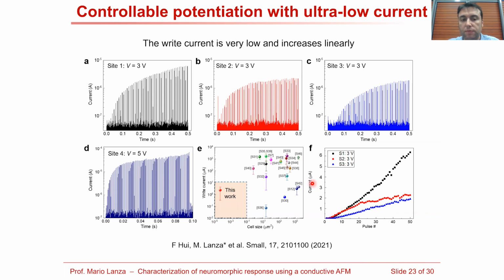We have observed that when we compare with many other studies in the literature, this value is remarkably low, which is also probably related to the fact that we have a very small cell, because our work shows the smallest cell possible. Here, we didn't include the STM work because it has this nanogap that doesn't match real devices. So you can find more information about these references in our article if you are interested.